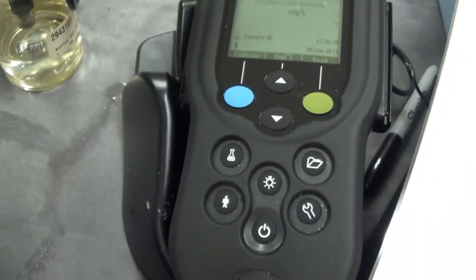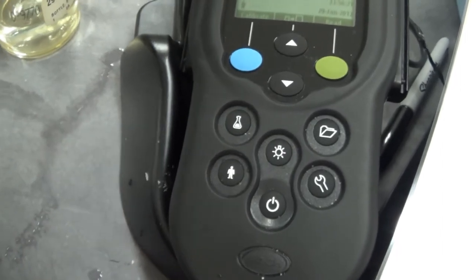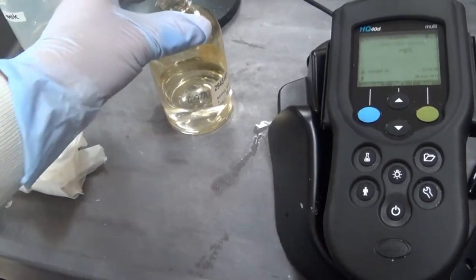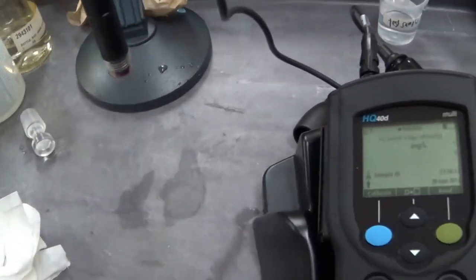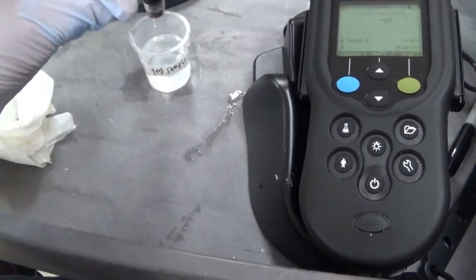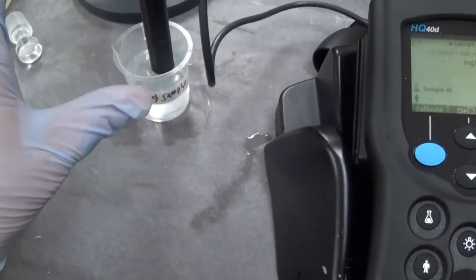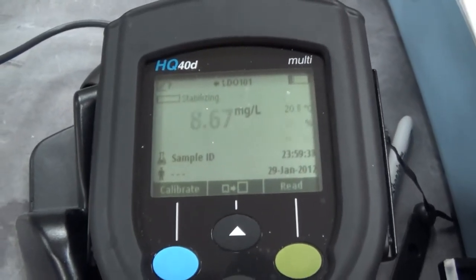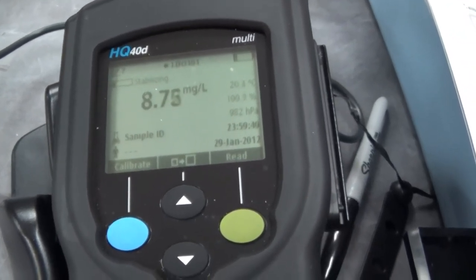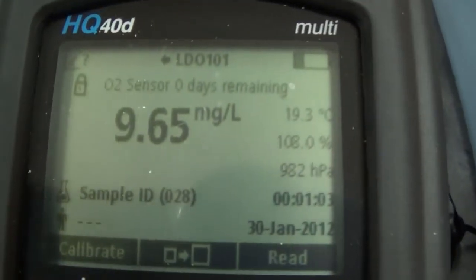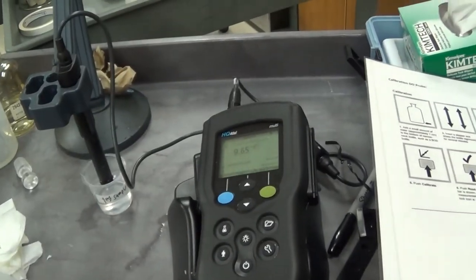Next, we are going to do our test sample. Obviously, our test sample is not in the proper container. But since this is a demonstration, we are just going to take a reading on our test sample. Of course, it has been exposed to air and all that, but it is just a demonstration. Let's see what our ground water is. It is still stabilizing. And there it is. That's our dissolved oxygen. And that completes our demonstration of our HQD meter.